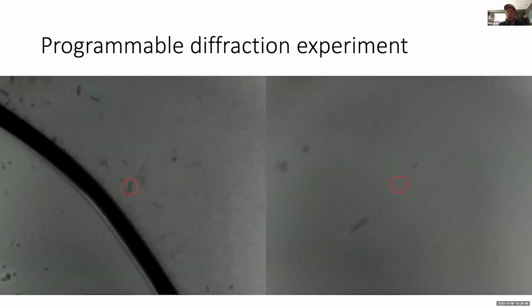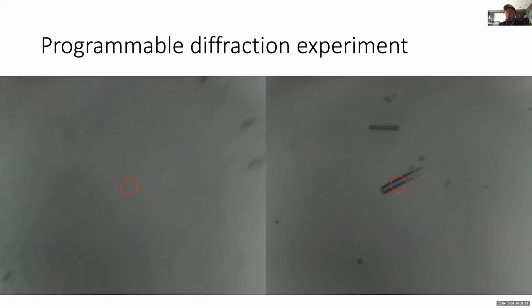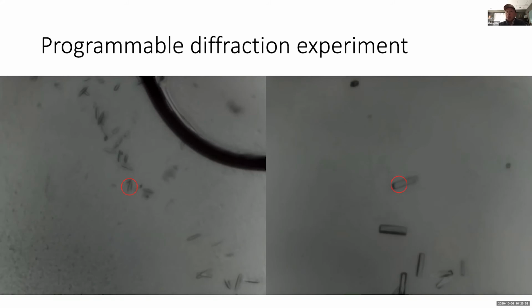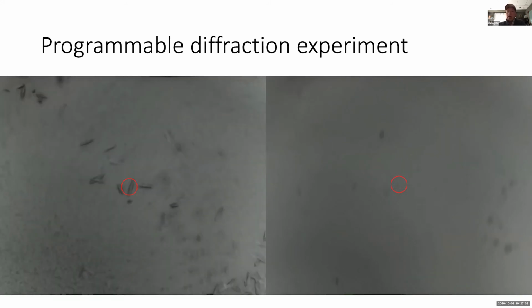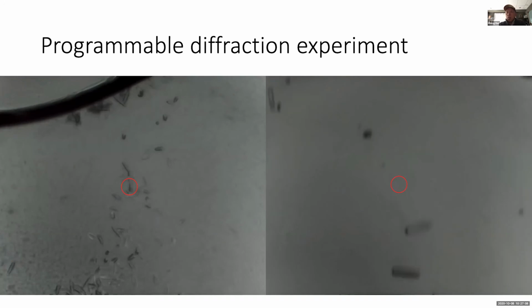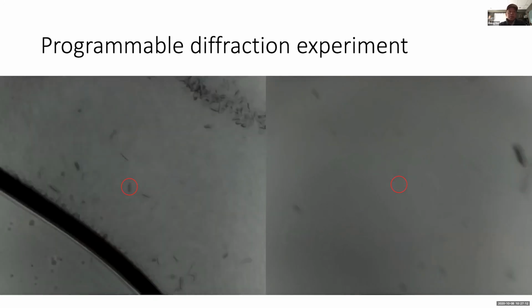And at every stop, an X-ray pulse will be fired, so that the detector can read out a diffraction image. And then we can do this at a really large scale. So with one button start, we can literally collect thousands of images.